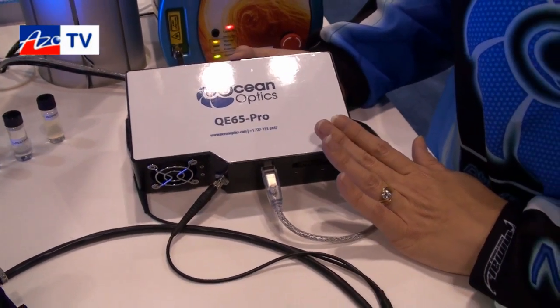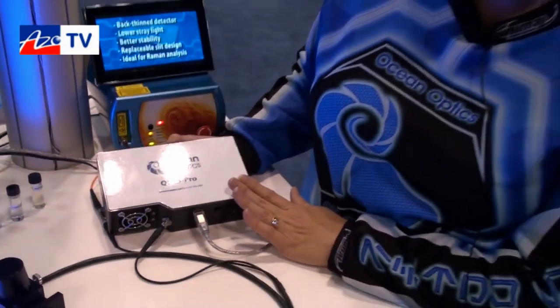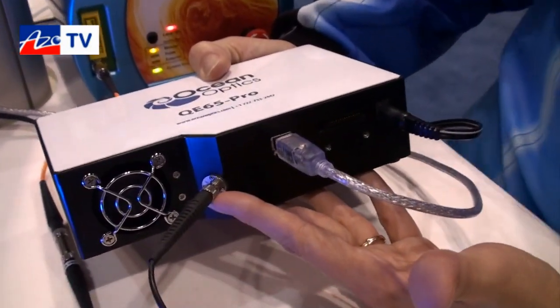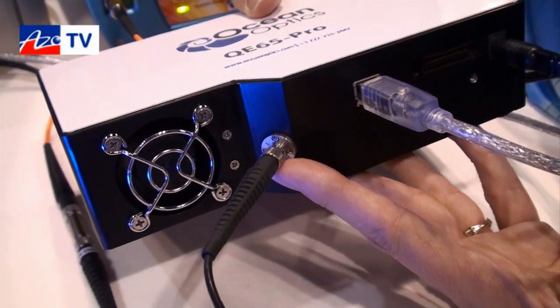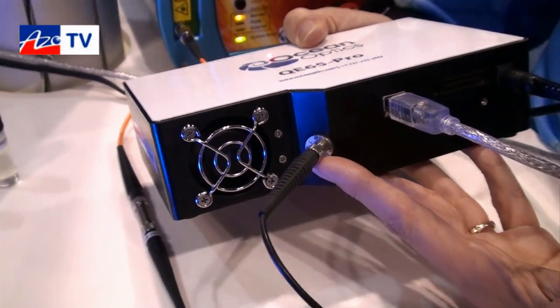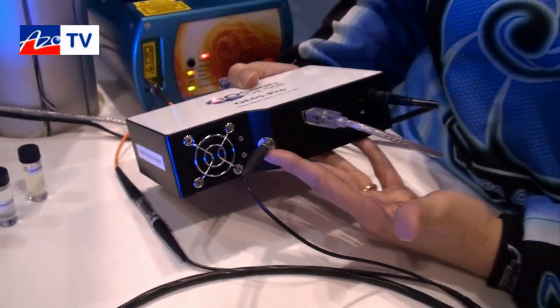We also have new ultra low stray light gratings included to help improve the stray light performance of the spectrometer. The spectrometer has more configurability, with a range of different mirror options you can include to optimize it for your specific wavelength range. My favorite feature is the interchangeable slits — so now you're not tied to one specific slit dictating your throughput and optical resolution. We can interchange slits to give you a range of configuration options.